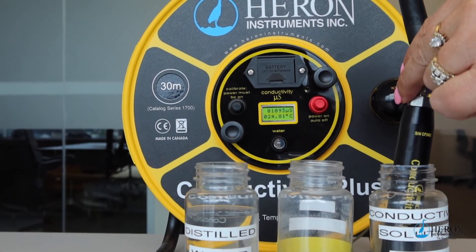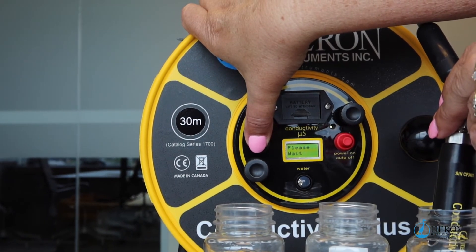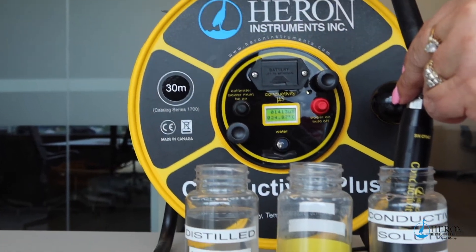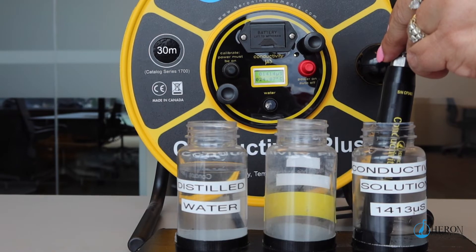Press and hold the calibration button on the control panel until 'Please Wait' appears on the display, then release the button. The meter will self-calibrate, after which the conductivity and temperature values will appear on the display panel.